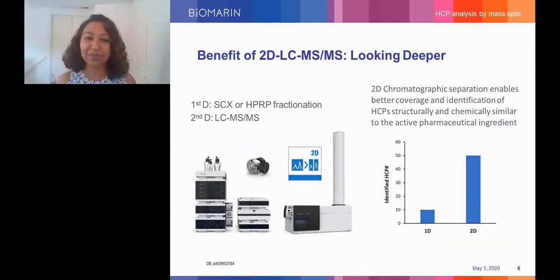So in terms of chromatography, there are many options these days. There's the traditional one-dimensional chromatography. Popular methods are just doing a reverse phase on the peptides. That's something an analytical chemist is usually quite comfortable doing. So that's an option. If one wants a deeper look at what's present in the sample, then 2D chromatography becomes a really good option.